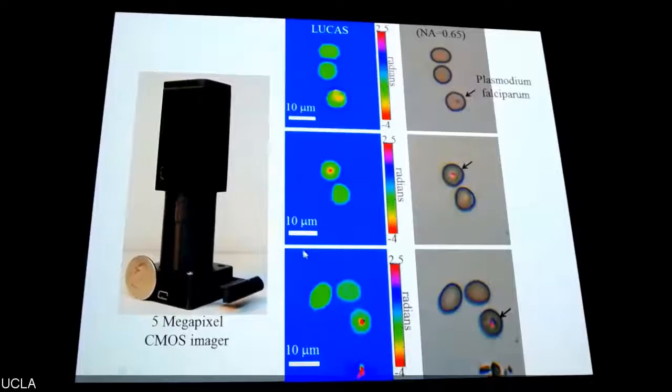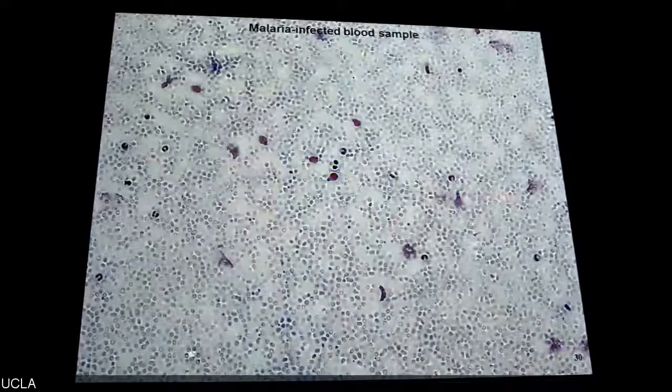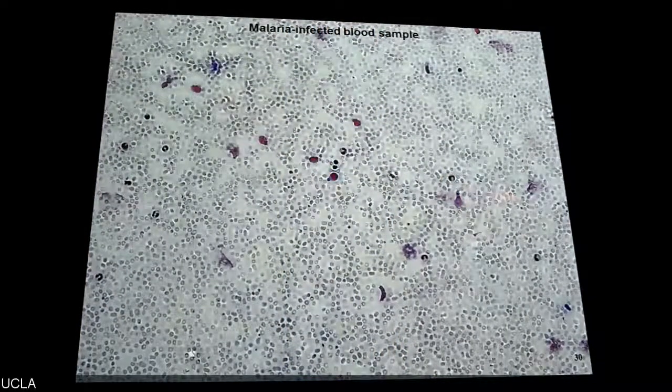One important use of these types of computational super resolution microscopes is to look into, for example, infection. And in this case, you're looking at red blood cells that are infected with malaria parasites. These are our reconstructions. This is, for example, a red blood cell, and this purple looking thing is a Giemsa stained parasite, Plasmodium falciparum, that is infecting the red blood cell, which has a very nice contrast, especially coming from holographic phase information. But the major advantage here is that we have a large field of view. We have 20 to 30 millimeters squared, which means you can look at thousands of cells.